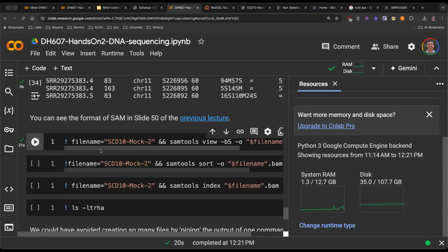Because tomorrow I want to retrieve only sequences that belong to alignments of gene X, wherever that gene X is. In the current format, I'd have to iterate through the entire set of records to fetch where exactly gene X alignments are. But I don't want to do that. I want to be smarter. I want to store it in a format so that anytime I give you location 1 and location 2, you can tell me what alignments happen in that particular region. You can do a very fast pull out of those sequences.